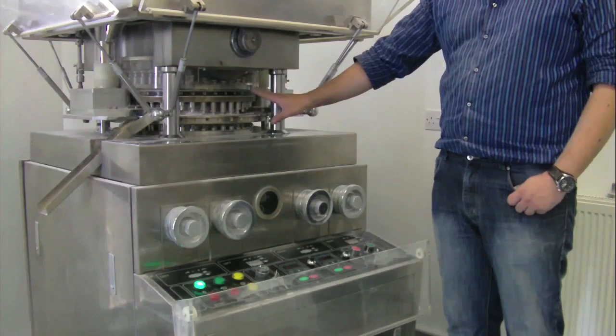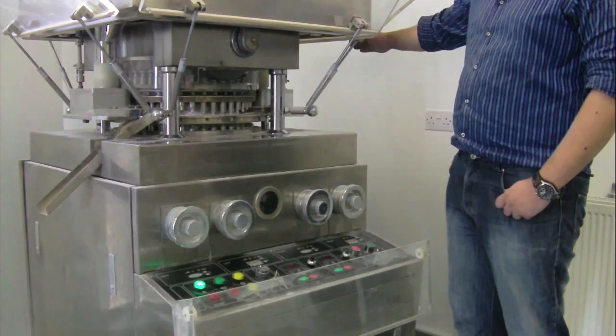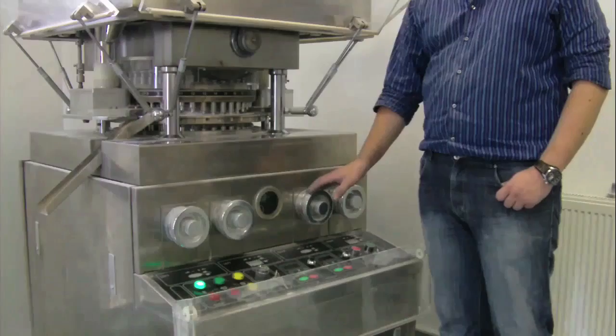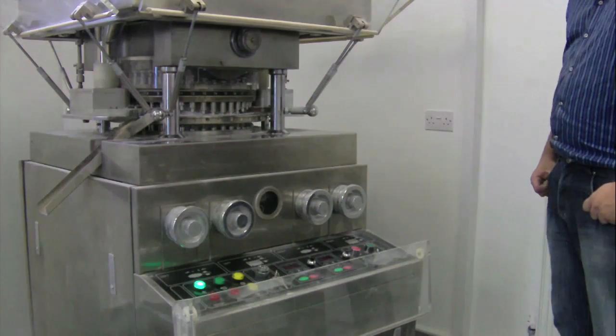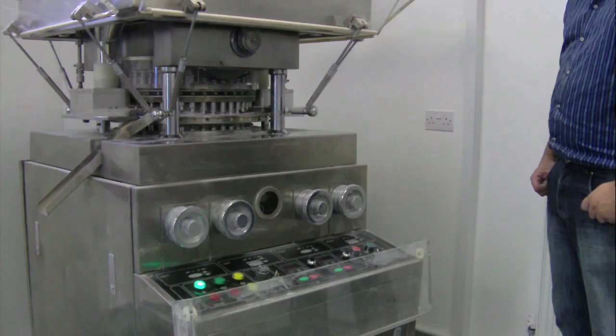There are two pressing stations to the 41 station, one on the front and one on the reverse. Both of these are adapted and controlled via the front knobs which allow you to adjust punch pressure and fill depth.